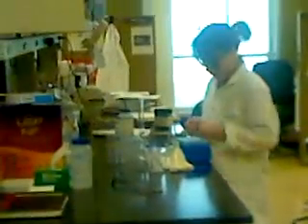Okay. And then the last lab on the QA tour is like the first lab in the process of things. All the incoming raw materials, all the powders are tested here first as we receive them from either one of our 4 farms like Lakeview or any other purchased item. There are some things we do buy. People think everything comes from a farm, it doesn't.